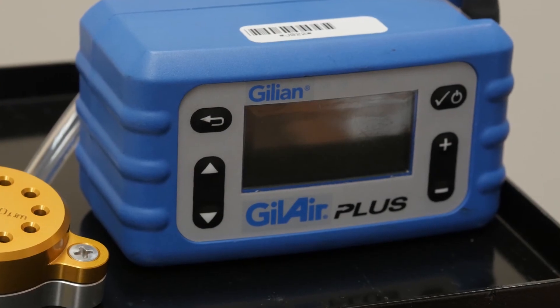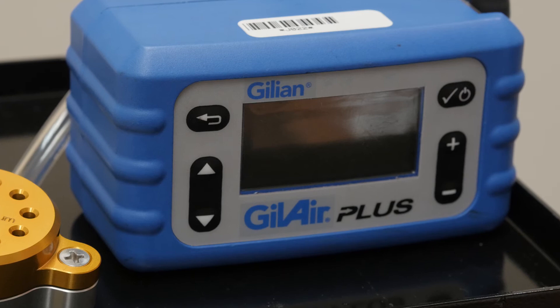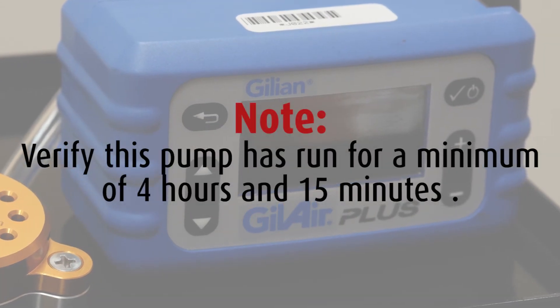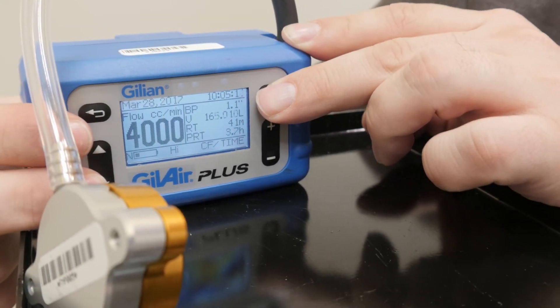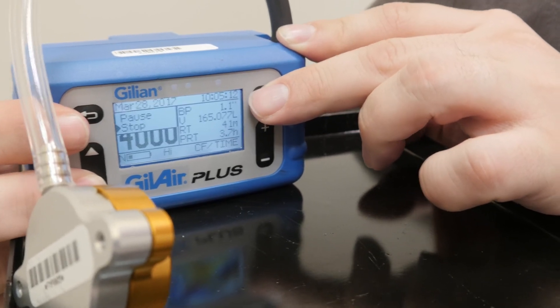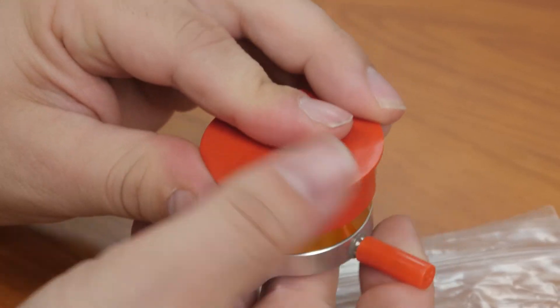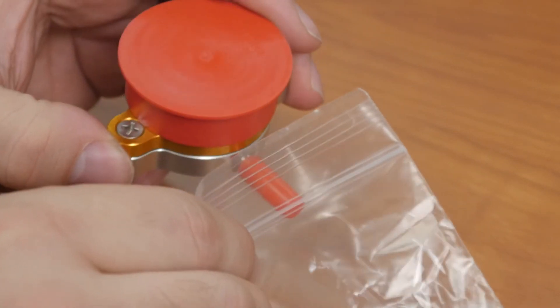Once all the previous steps have been performed, it should be time to turn off the PEM-10 sampler pump. Verify this pump has run for a minimum of 4 hours and 15 minutes. Click the button that shows an arrow pointing to the left, and using the up-down arrows, select Stop. Now, recap your samples, place your sampled PEM media back into its original bag, and seal the bag.